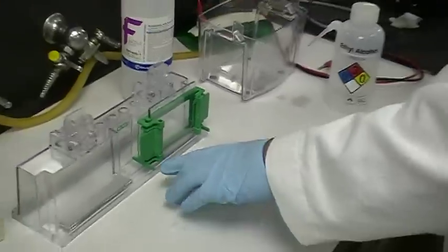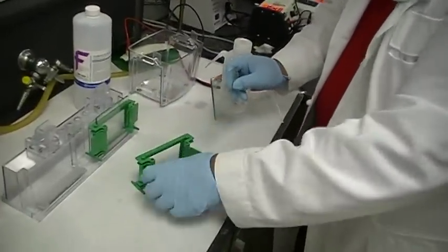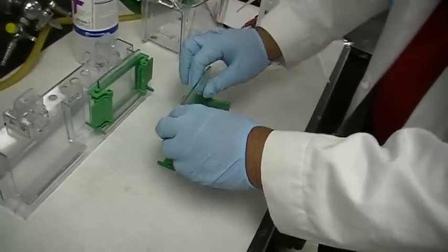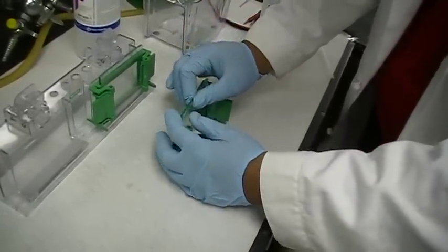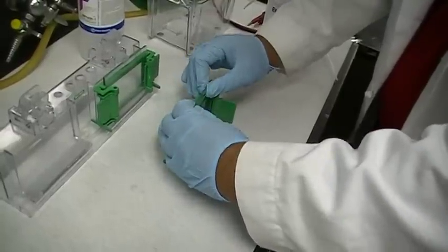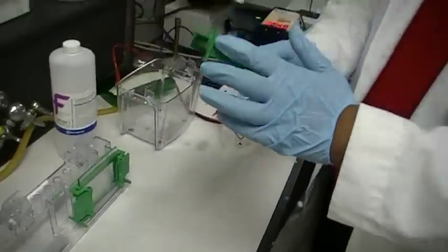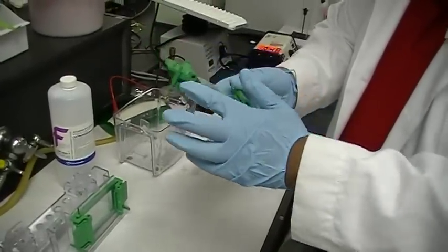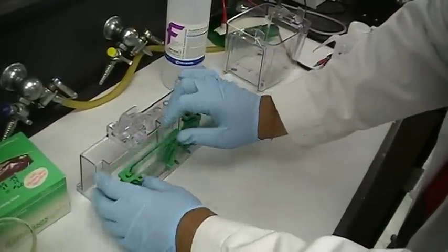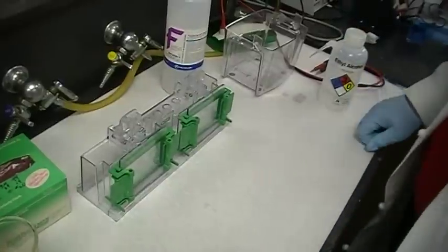Grab the other set of plates, work it down like that, get the clamp, and put the set of plates in between. Hold it down firmly on the bench, clamp one end, hold it down firmly again, clamp the other end, and inspect to make sure the two plates are flushed. Stick it into the stand, pull back, and clamp it down.